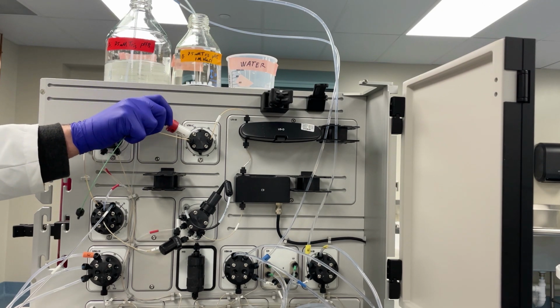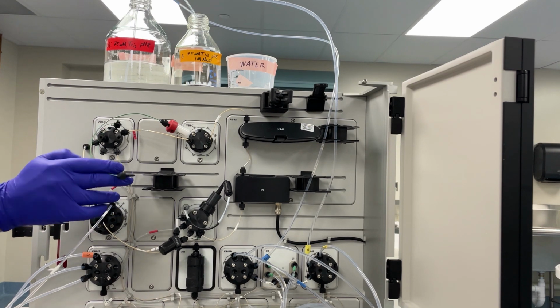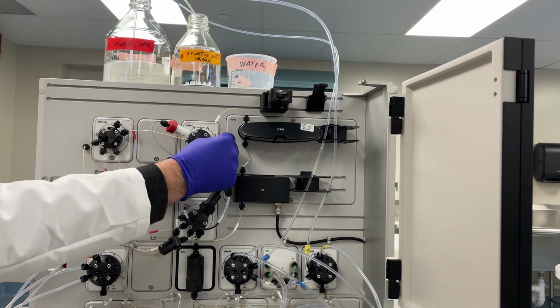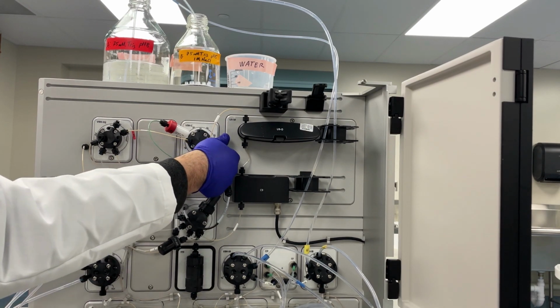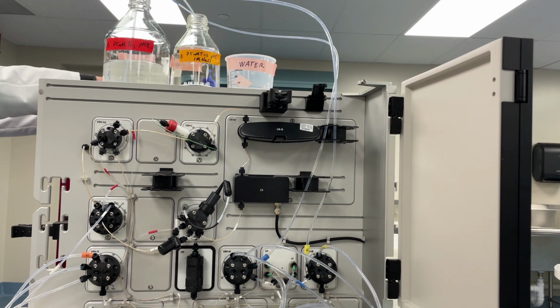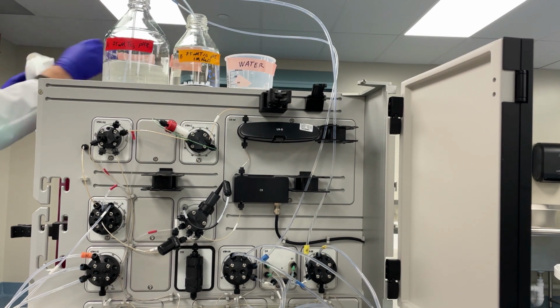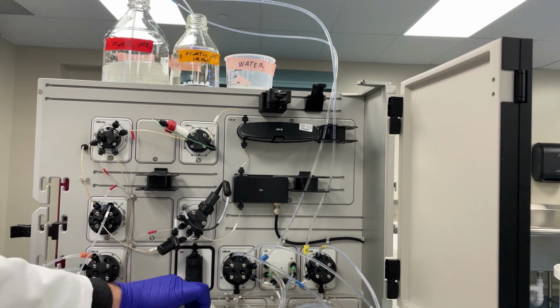Then we'll take the tubing that'll connect the top of the column valve to the bottom of the column valve. You notice the drip right there? I like to make a mess while I attach the column. This helps to prevent any air from getting onto the column. Give me a second just to clean up all the little drips.